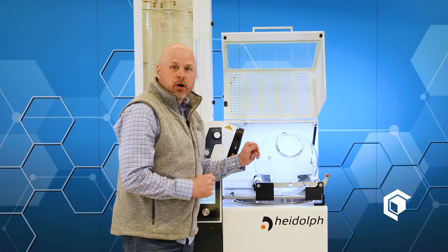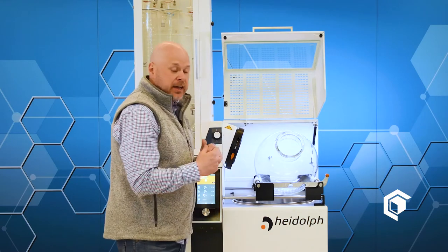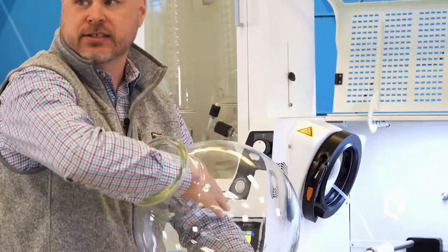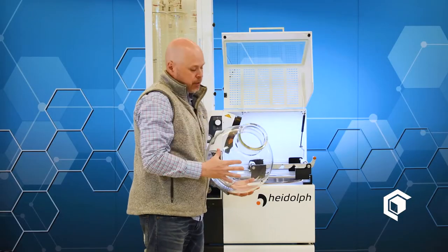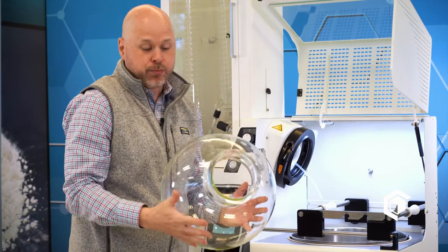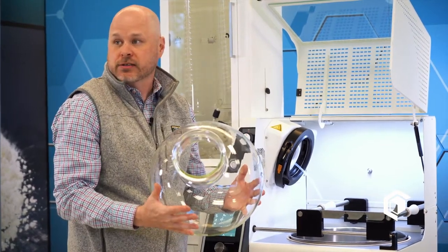I wanted to show you as well the next size and how easy it is to fit your hand into the flask itself. Because if you have to scoop any material out, it's very easy to get a scraper and scoop out the crude oil which is left in the evaporation flask.